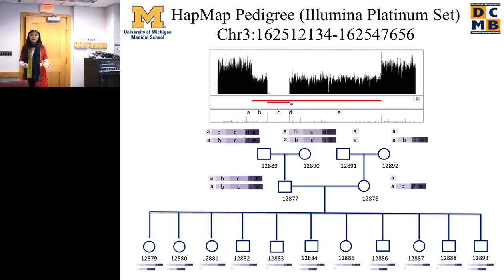Also, you have to know the higher coverage we have, the better result we could probably get. But the larger the BAM file is going to be, so the longer it takes. For the iteration step, I think it takes long because in each step, we have to remap all the reads back. And it's not just the abnormal reads.